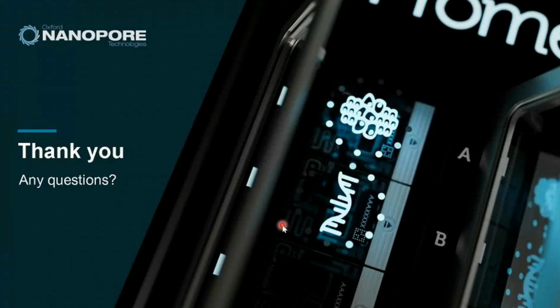Yes, we can use it for this purpose, just that today my scope is more about food and food-related topics. But our sequencing technology can be applicable to basically any type of metagenomic or environmental sample. For example, we can have gut microbiome, or in your case, fecal samples, as well as soil samples, even water samples. So we can study all these microbiome metagenomic samples across the range that I mentioned just now.